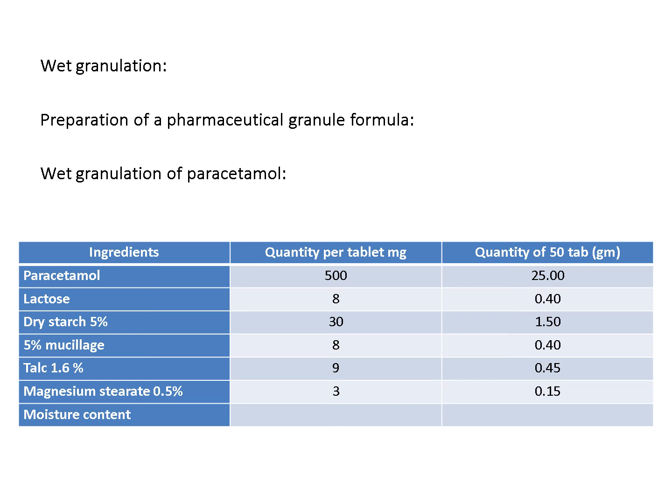This is dry starch, and we call it a disintegrant. The purpose of the disintegrant is to disintegrate the whole tablet into granules and disintegrate the granules into fine powder. So we will add it in 2 positions. First of all, while we're forming the granules, we will divide the 30 milligram by half.